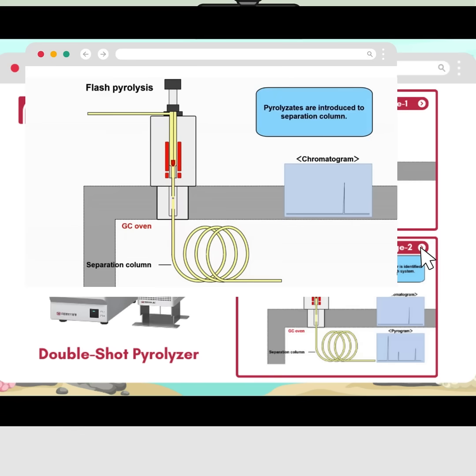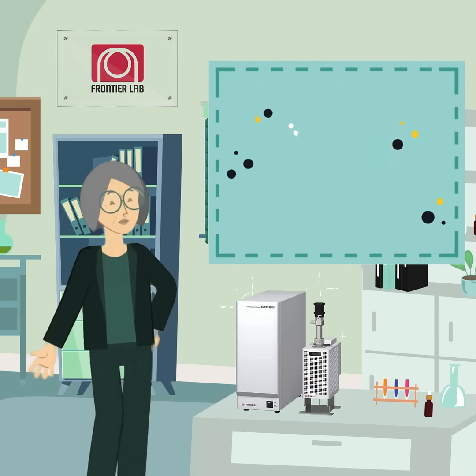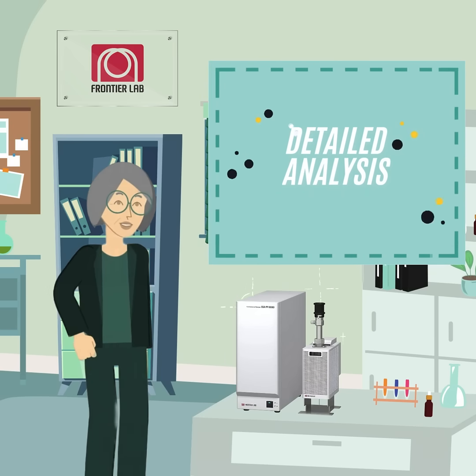Next, the same sample is reintroduced for pyrolysis, heated at a higher temperature to decompose the remaining material. The resulting pyrolyzates are analyzed to identify unknown polymers. This two-step process ensures precise separation and detailed analysis of complex samples.